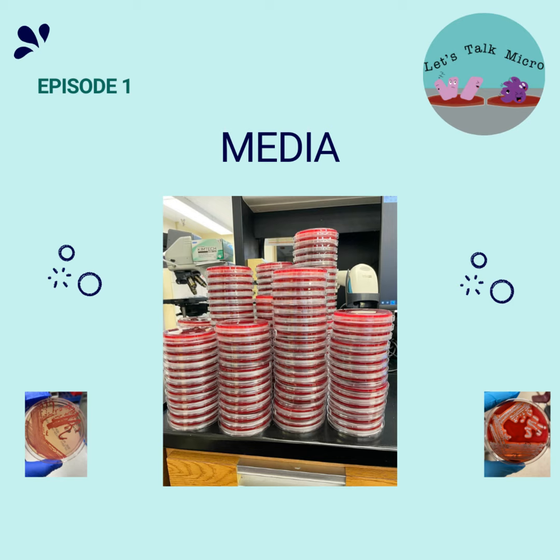And an example of enriched media, besides the Lim broth, is chocolate agar. And chocolate agar is basically heated blood agar, which releases factors so that it has both the X and V factors, which Haemophilus, like Haemophilus influenzae, needs to grow. So that's why Haemophilus can grow in chocolate, but it cannot grow in blood agar. Right? Blood agar has the X factor, but doesn't have the V factor. Chocolate has both of them. And it also helps organisms like Neisseria gonorrhoeae to grow better.